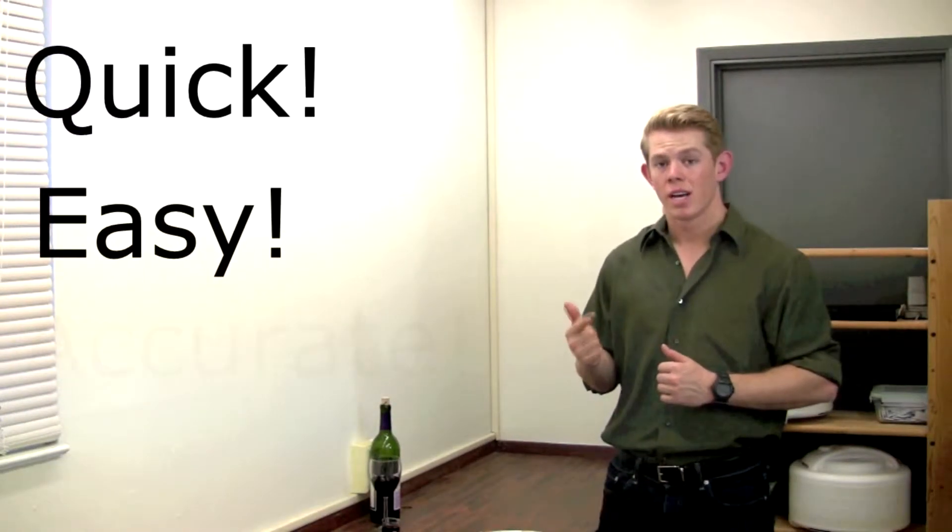So, as you can see, ACIVEN tests are quick, easy, and accurate. So the question I have for you is, with all of this extra time, what are you going to do?